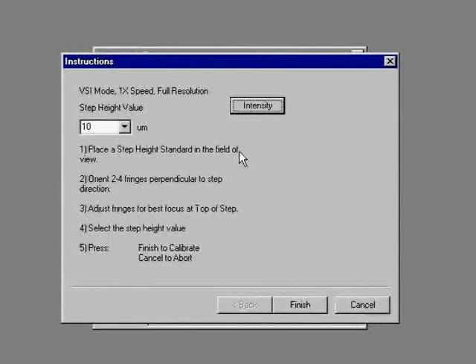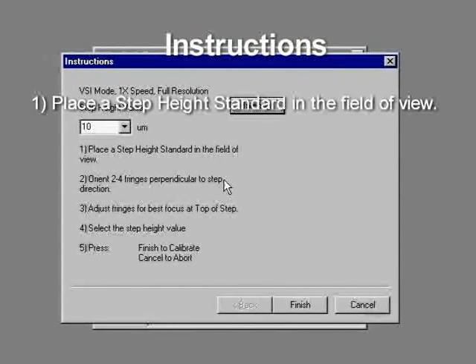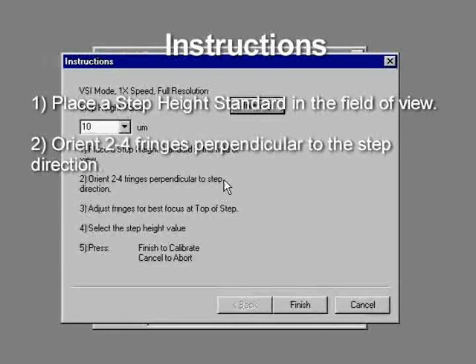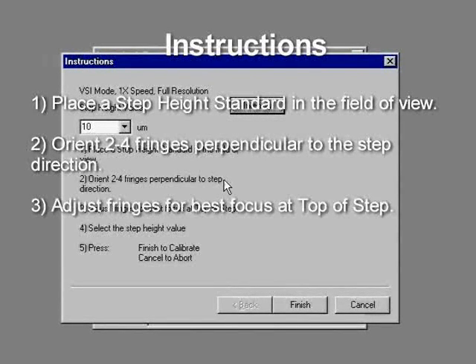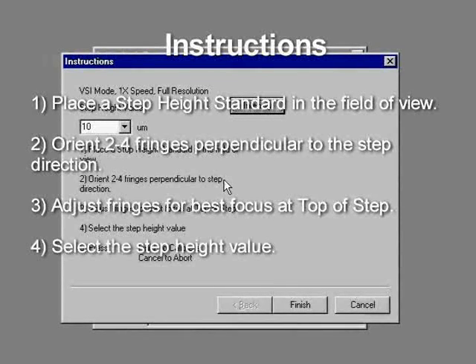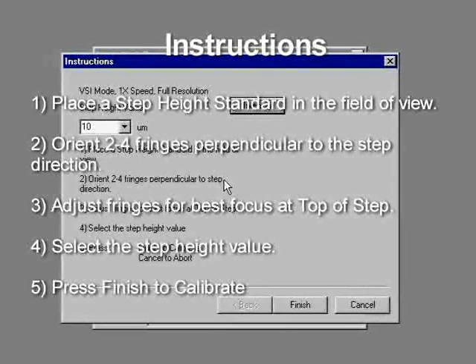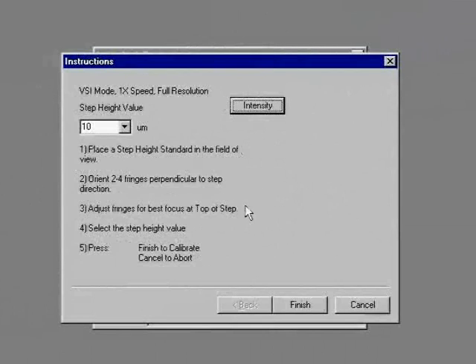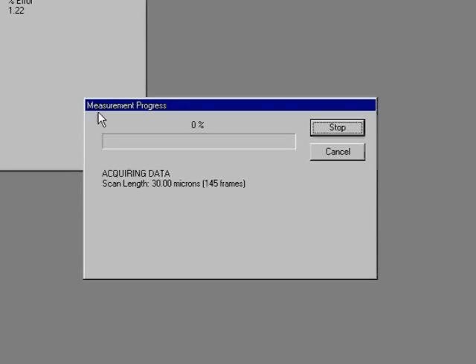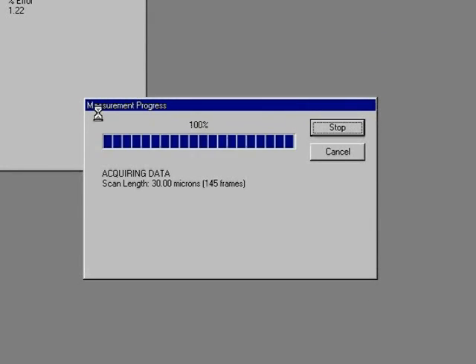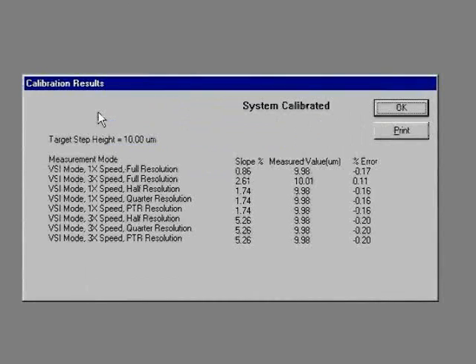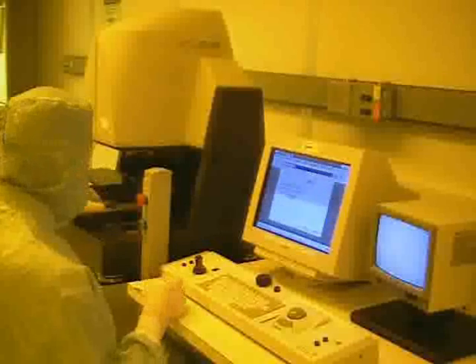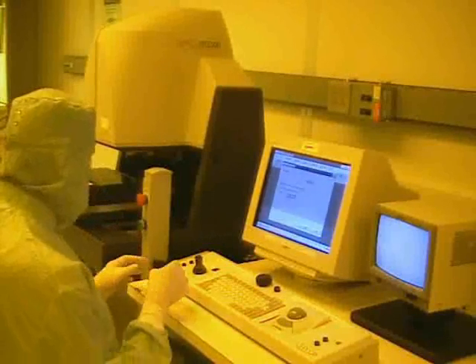Before clicking finish, let's recap the steps we have completed. 1. Place the step height standard in the field of view. 2. Orient 2 to 4 fringes perpendicular to step direction. 3. Adjust fringes for best focus at top of step. 4. Select the step height value. Step 5 is to click finish. Once we do, the profilometer will perform the calibration in VSI mode. You need not worry about the results of the calibration. Once it's finished calibrating, replace the VSI sample in this box.